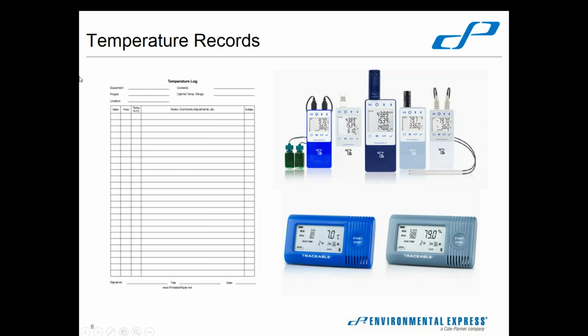Recording those temperatures. So again, back in the day, your manual logbooks here on the left. Just a simple writing down of the temperature, who did it, when it was done, the day, the time, the actual recording, any notes that you may need to make on it. I think a lot of us have used these and probably have mean thoughts about them at some point in our job and wondered, man, I wish there was some better way to do this. There is, depending on your particular program area requirements.